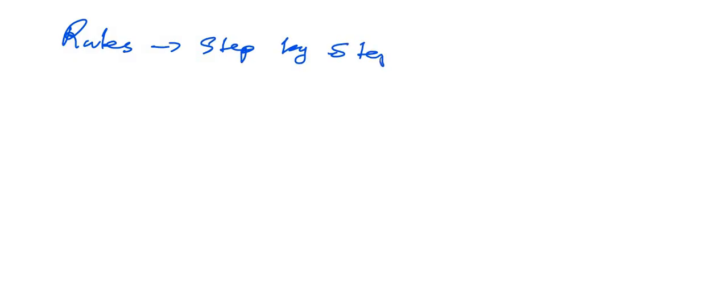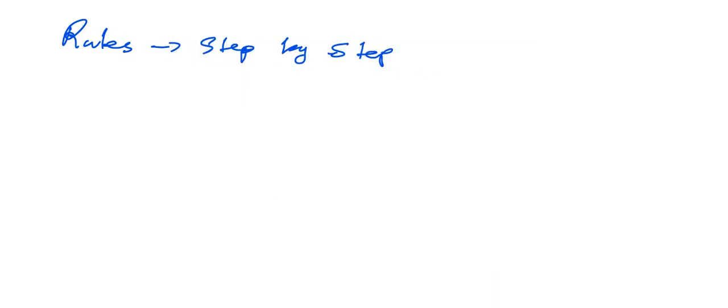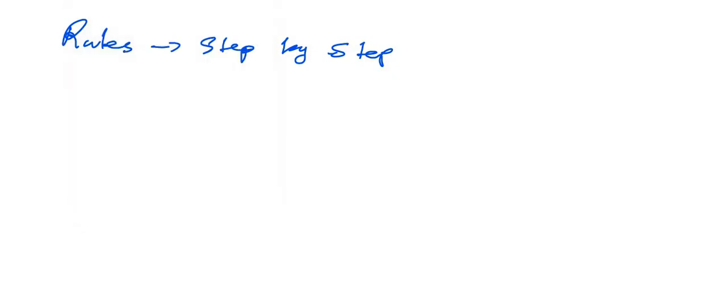You just have to follow the steps and also make sure that you have all the apparatus that are relevant, that they will indicate in the whole thing. They'll list them. So you need to make sure that on your station you have the apparatus, everything that you need in place. And it's calibrated, you have to rinse them. So all those rules, everything else, they will be observing you. Obviously, things like you being in a proper outfit, those are obvious things that you know already. Your safety boots, your goggles, everything else. Yeah, so the rules will be given to you, the instructions. And all the apparatus are supposed to be in place.